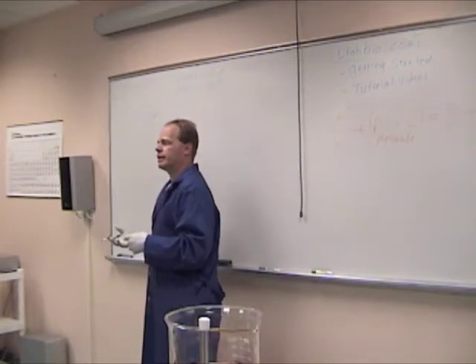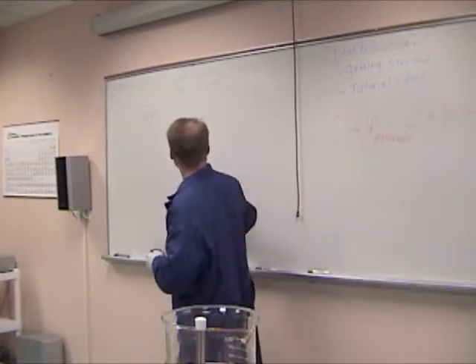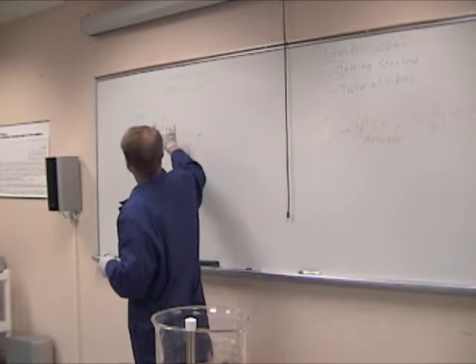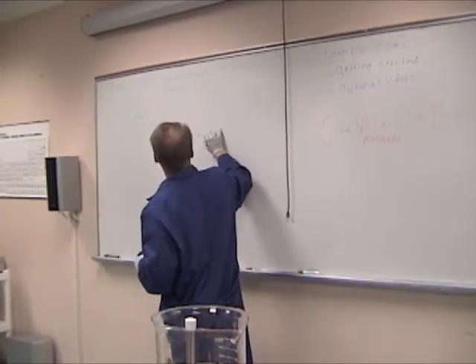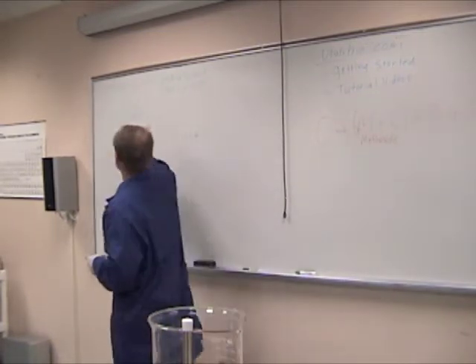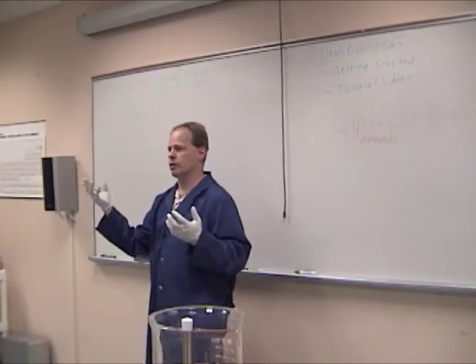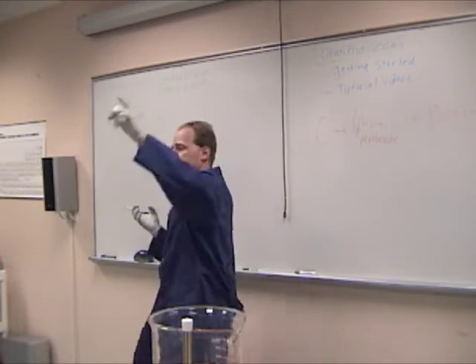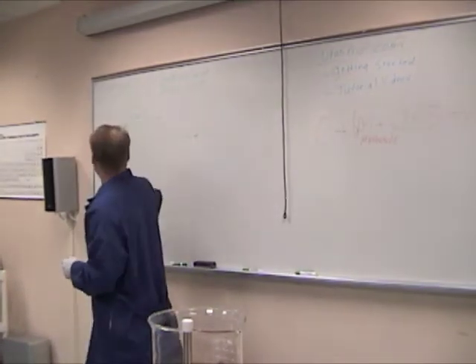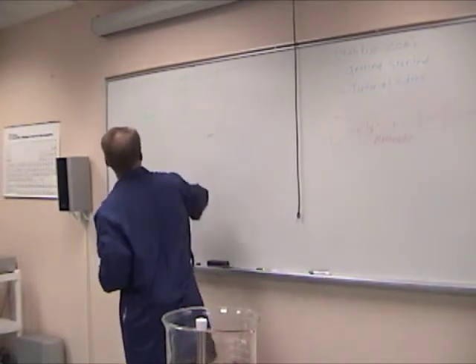Tell me how acidic it is so I can take my 7.5, which I know is what it takes to make biodiesel in new oil, and then add the amount of base to fully neutralize that, so I still get biodiesel left over. You're going to make some soap, because we're going to ruin those acids, but that's how it works. So I'm taking just a volcano, with baking soda, in this case a much stronger base, which is potassium hydroxide, and lemon juice, which is the acid in an oil, and I'm going to add a base to it and figure out how much that is.